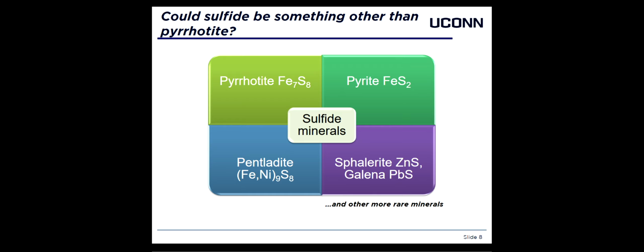In northeastern Connecticut samples analyzed so far, we have seen that all samples contain pyrrhotite only, and none of the other forms. So the assumption that all sulfide is present as pyrrhotite is likely a good one in this region with a particular geology.